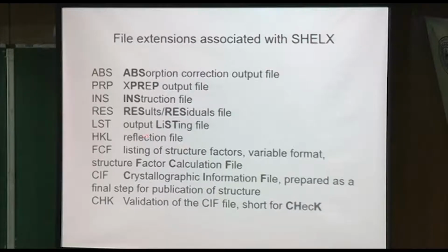Okay, HKL, I think that's your data. That's the important part. That's your structure data in the HKL file. It's a big file, it can be very big. But all of these are basically ASCII files. You can open them in Notepad, or in SimpleText, depending on your computer.